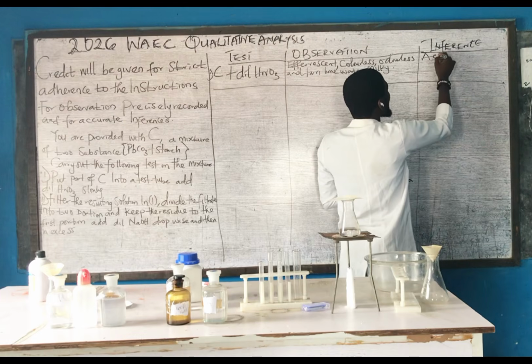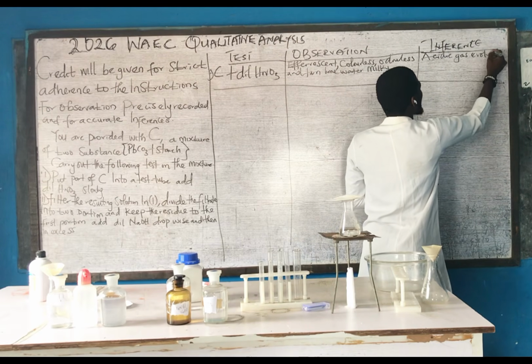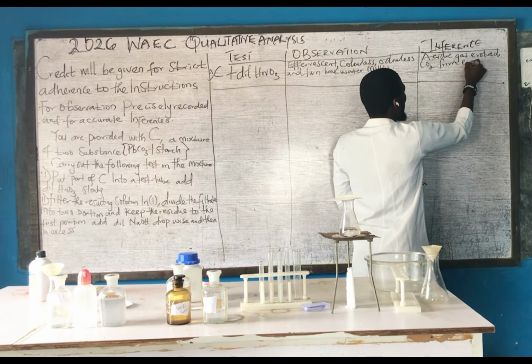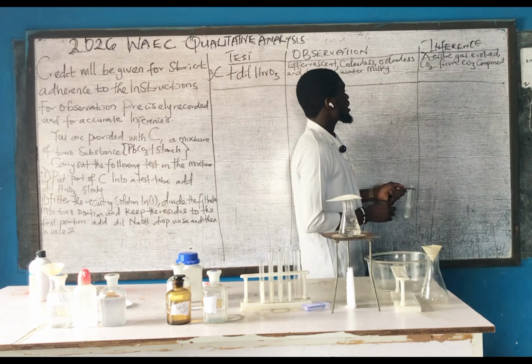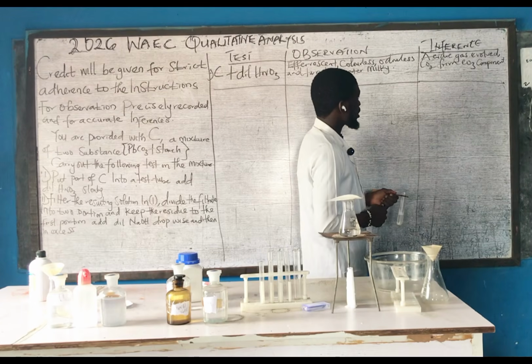Are you with me now? Inference: acidic gas evolved, CO2, from CO3 component. Are you with me now? Acidic gas evolved, CO2 from CO3.